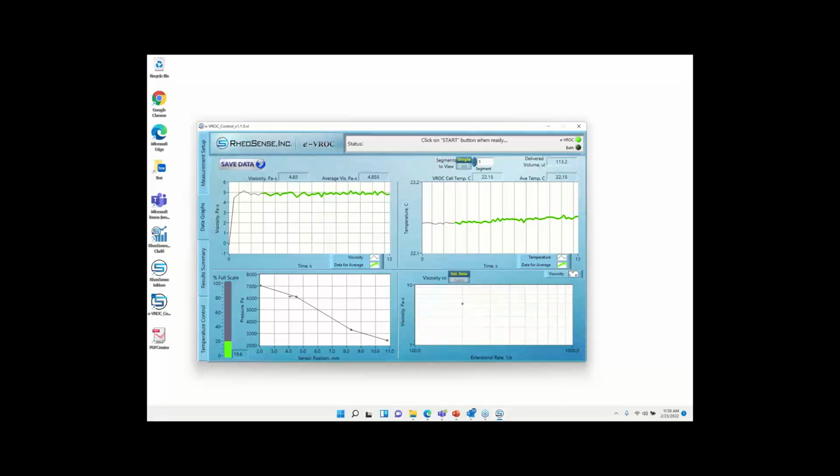It's what we expect with this particular constriction in the center, where we have a more rapid drop. And then we also have a nice viscosity plateau where we can average over data. In this case, we're not controlling temperature, but you can monitor how stable it is under temperature stable.